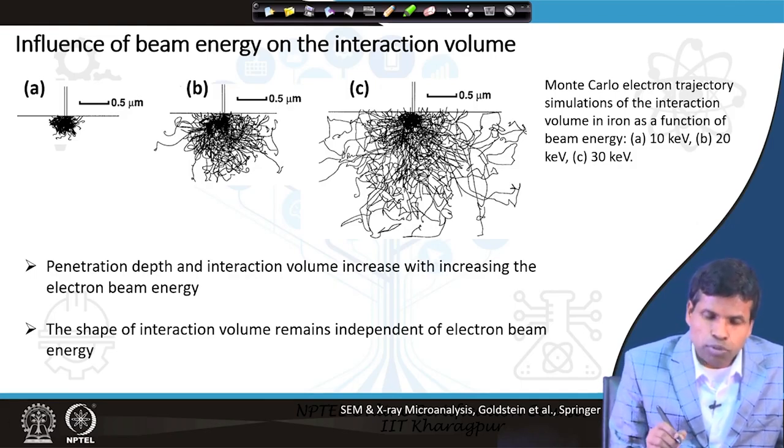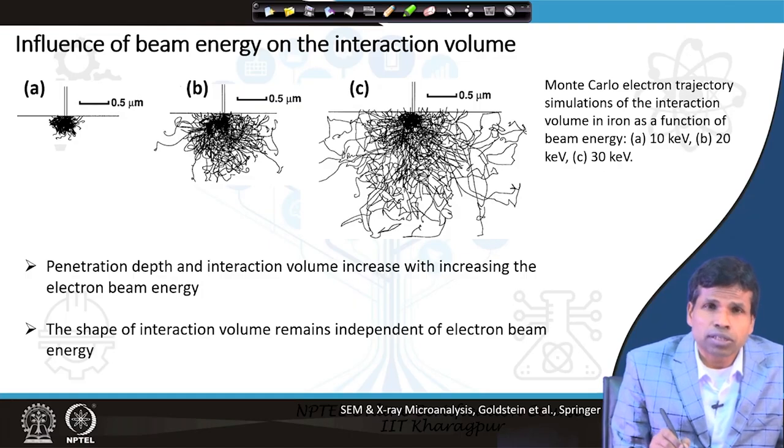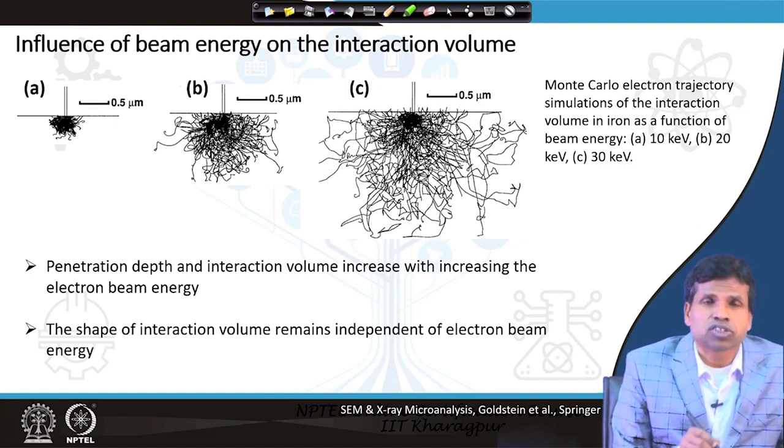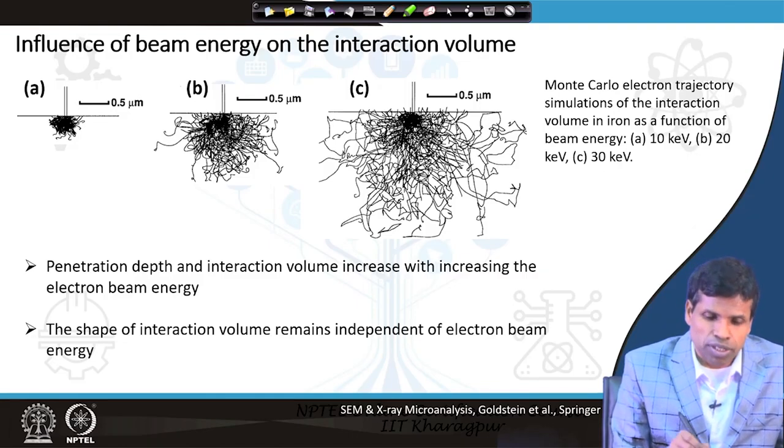That is most important. If we want to go for high resolution photographs, SEM images, then we should better choose a lower acceleration voltage during the measurements, during the operation, so we can only obtain the signals near the surface without going much deeper into the materials.